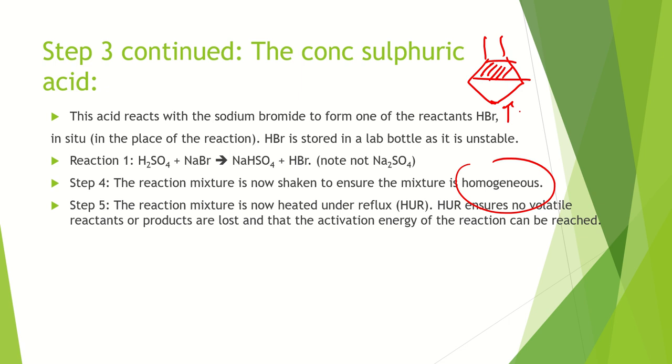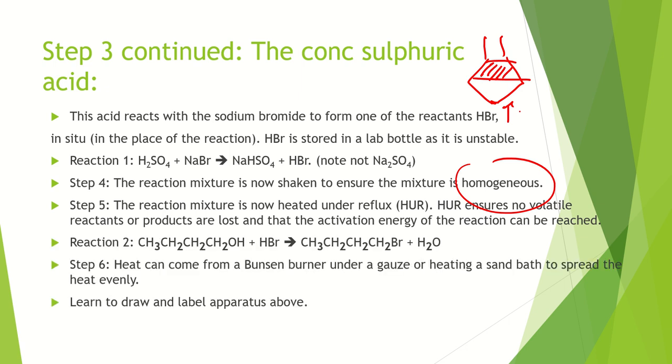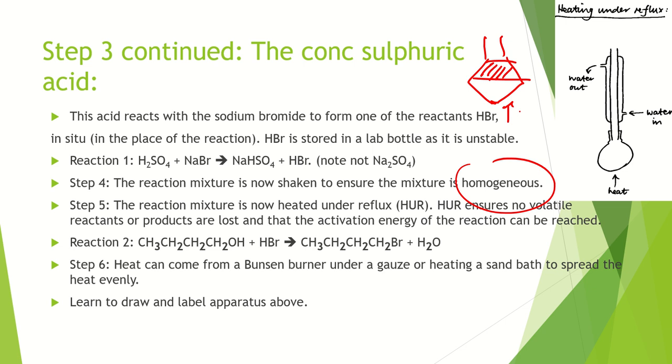The next thing we're going to do is we're going to heat this under reflux, which is a new type of reaction apparatus to you, and we'll look at that in a wee second. But there's 2 reasons why we heat things under reflux. We'll look at the apparatus here and I'll explain why we heat under reflux.